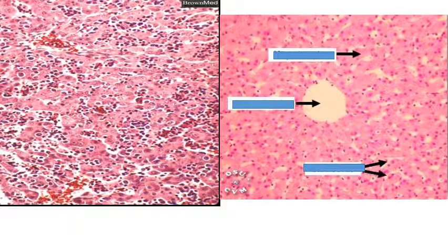We already saw this picture in the last lecture, and this is going to be the liver. How can we tell it's the liver? Well, we have the central vein. And what are these? They're the parenchyma, which means the active, useful tissue of the organ you're looking at. So this would most likely be our hepatocytes. And what are these spaces? If you guessed sinusoids, you are correct.